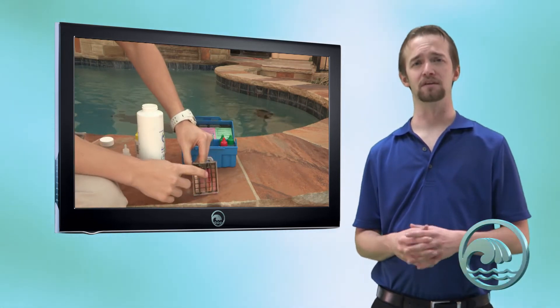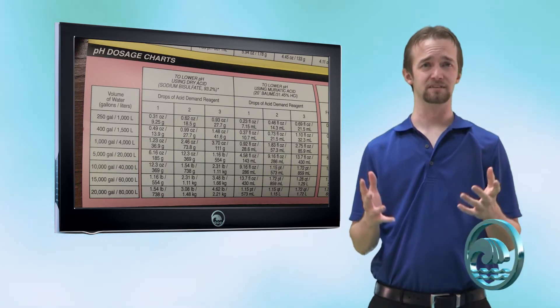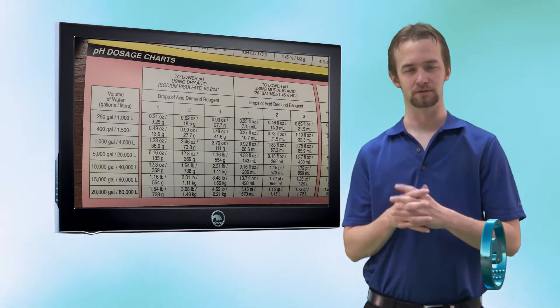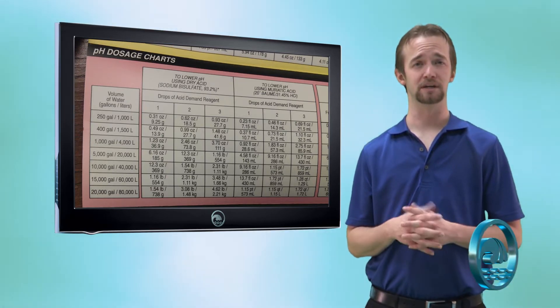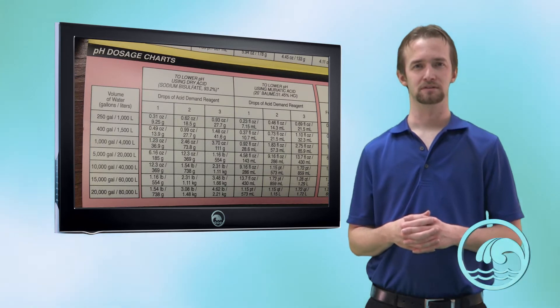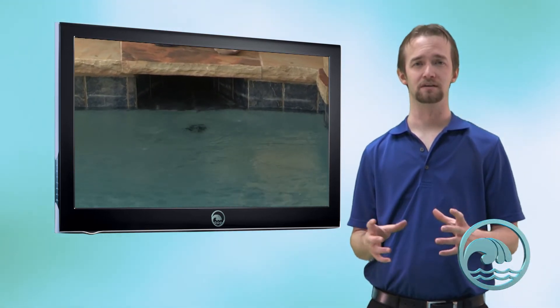Take the little booklet out of the lid of the K1004. After you've gotten the number of drops needed, you'll see a red acid demand treatment table on the inside. Let's say it took us three drops — go to the treatment table and look for the section that says 'lowering pH using muriatic acid' in the middle. We did three drops to achieve a pH of 7.4, and our pool is 10,000 gallons, so it's going to take 1.72 pints of muriatic acid — that's roughly a little over three cups, about three and a half cups of acid. Muriatic acid can be added by measuring it out at 8-ounce intervals and pouring them next to returns in your pool, to help mix the acid and ensure it doesn't fall to the bottom in a concentrated area and cause pitting.